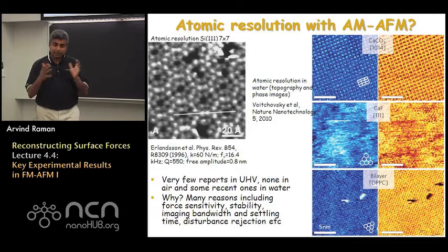There are many reasons which we can't go into detail on at this point, but they include, amongst other things, the sensitivity of the observables in tapping mode AFM to the tip-sample interaction forces. It also needs consideration of the fact that the settling time in tapping mode AFM is different from frequency modulated AFM because of different feedback loops in the process.